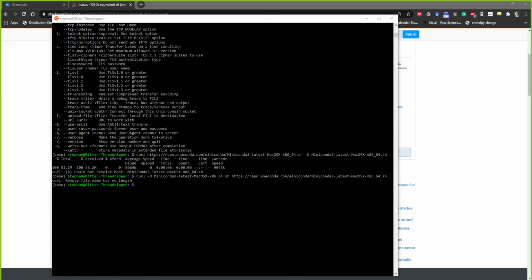If you've already installed QIIME, should I install BioConda as well? Jay, I guess it depends on how you installed QIIME. I'm assuming you might have done a virtual box, but if you've already got QIIME running, then... I installed it via the whole Conda or Miniconda thing. I got the wget and then used wget to get it.